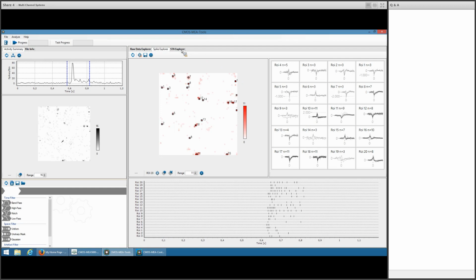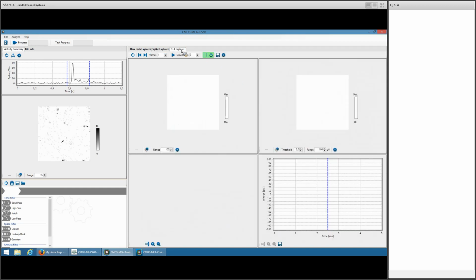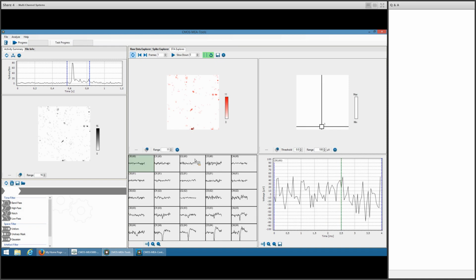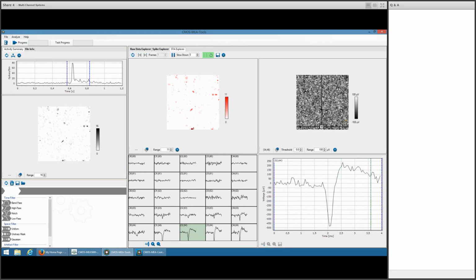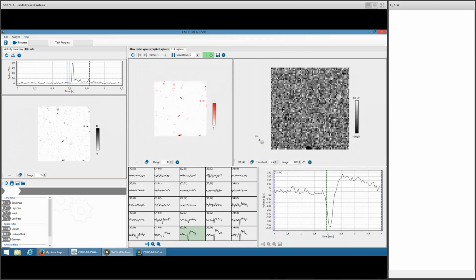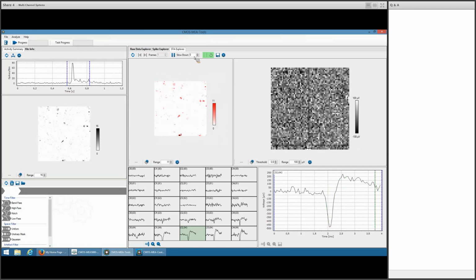And something that is pretty nice, you can do a so-called spike-triggered average. So you take one spot of activity. Let's say we take that signal here, and we generate a spike-triggered averaged movie around that spike. Enlarge it a bit and make it a bit slower.